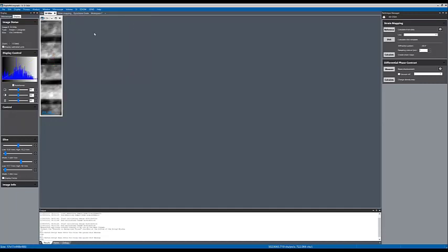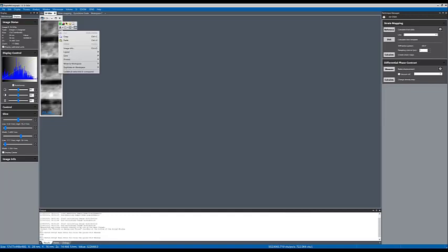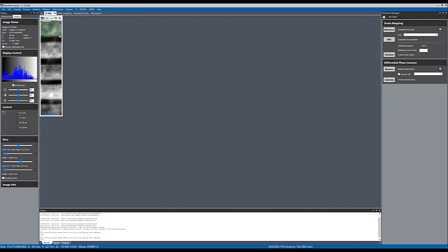So first, we have to tell the software where is the region of the sample that does not have any strain. So you use this unstrained area tool. You draw a box where you know there is no strain in the specimen. So I know in the silicon layer here, I have no strain. So I specify that region and I click calculate strain.